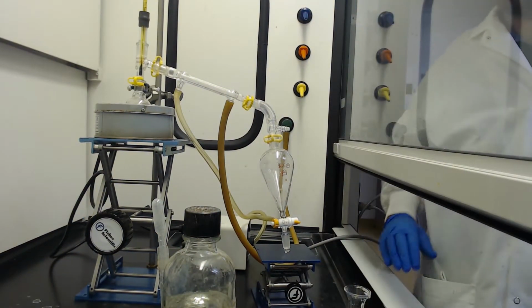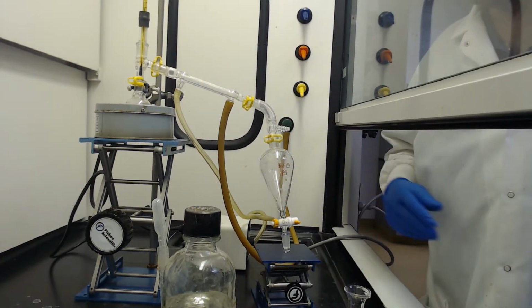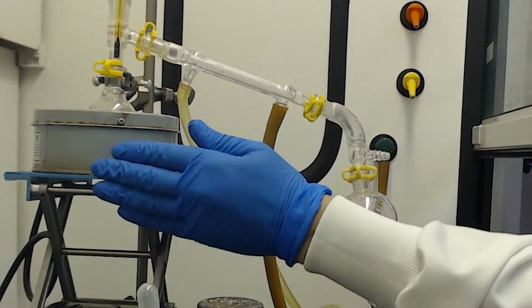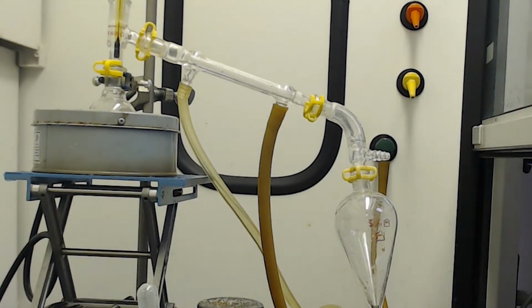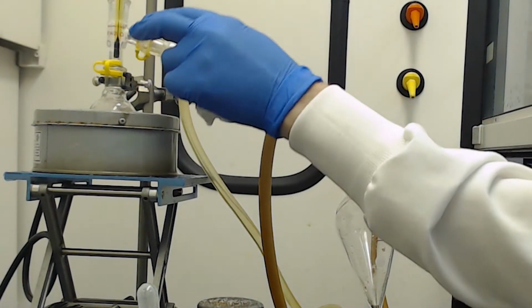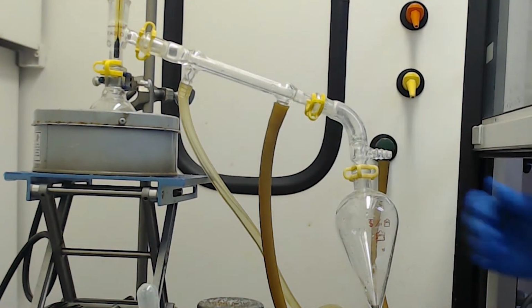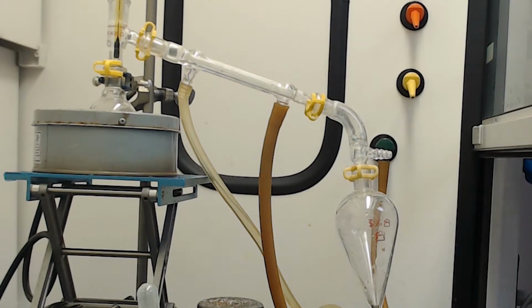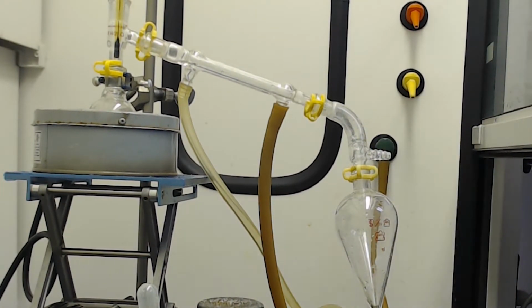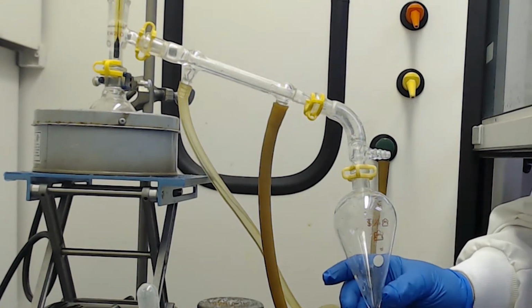Okay, so I've taken the liberty of setting up our distillation apparatus here. We have our lab jack with our heating mantle, so we can lower the heating mantle. We've got this whole thing secured here with the clamp. We've got clips here. We've got our distillation head. We've got a column for condensing, and then we've got the vacuum adapter here. And we're changing the procedure a little bit in that we're going to just distill straight into our separatory funnel.